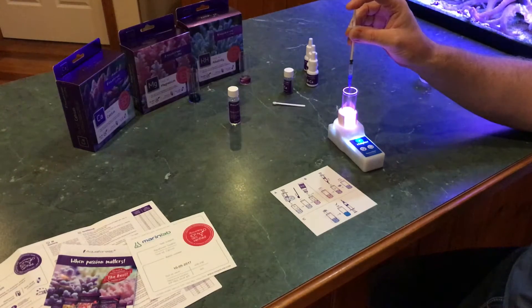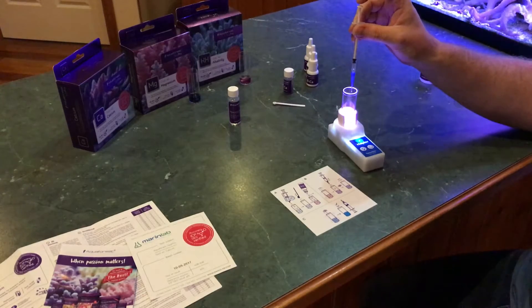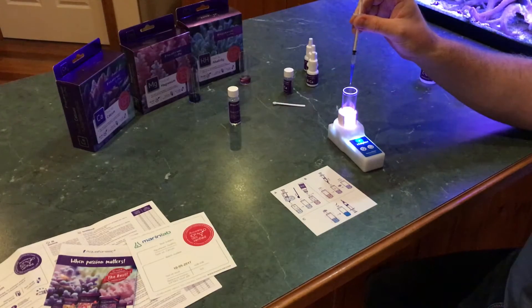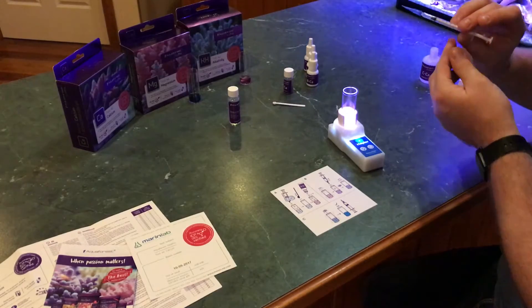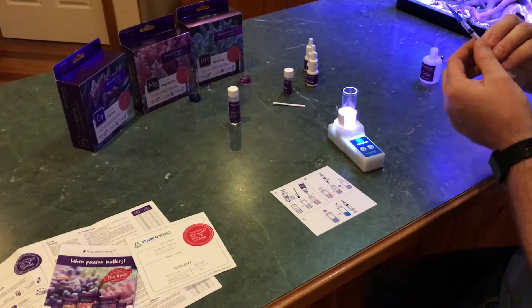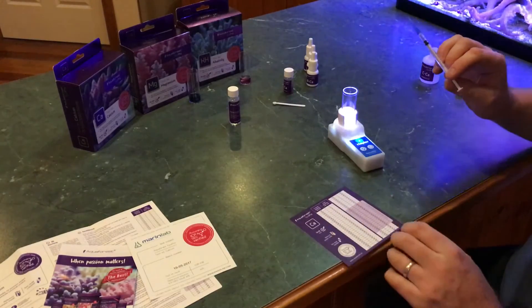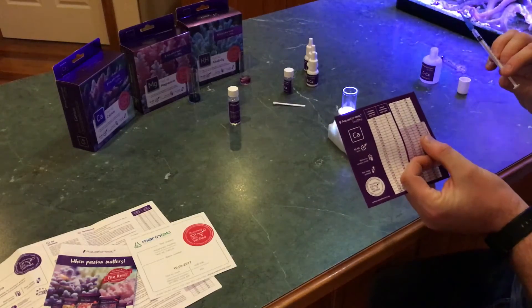I can hear my daughter on the baby monitor — lucky this is my last test kit because she needs to get up. Starting to turn blue — it's still pinky blue, just give it a few seconds to see if it stays that color. It needs a couple more drops. Now it's gone blue — we'll see if it holds. Give it 10 seconds — looks like it's going to. That's 0.21 mL. I'll give it one more drop — did go a little bit darker blue. I'll measure between the two: 0.2 mL left on the syringe, which tells us it's 400.